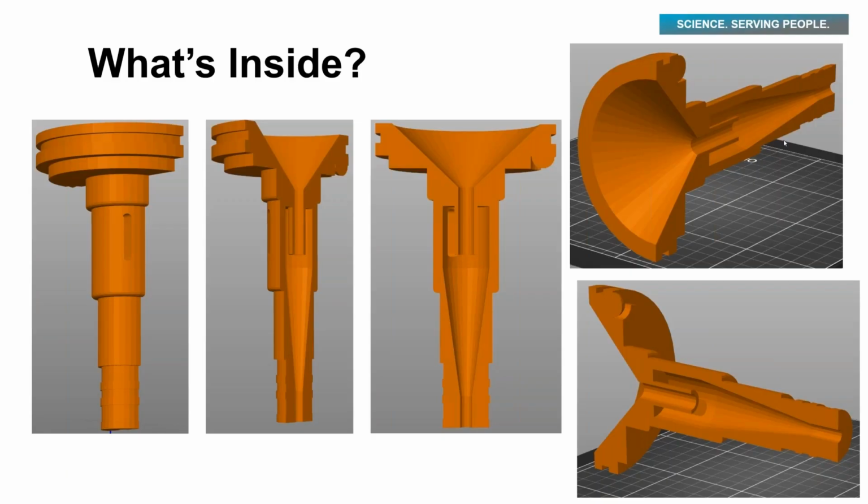As we look at it from a different angle, we see that depending on how you clean these cyclones, it may impact how much dirt or debris is left inside of the cyclone. If you were to take this cyclone, clean it out with water and put it up on its end, you'll see that there are a lot of spaces for dust and debris to collect inside down here in the top chamber.